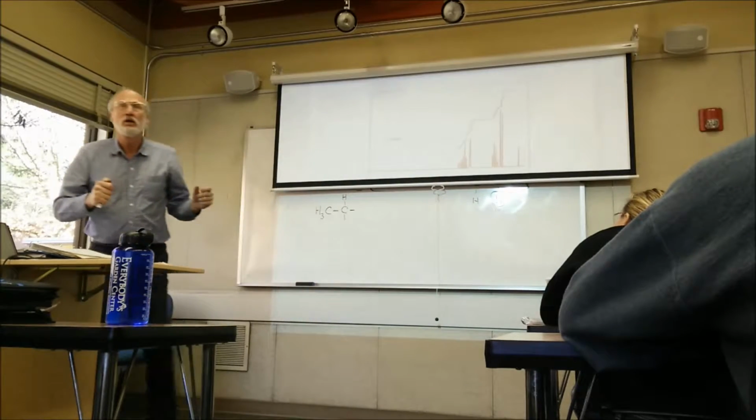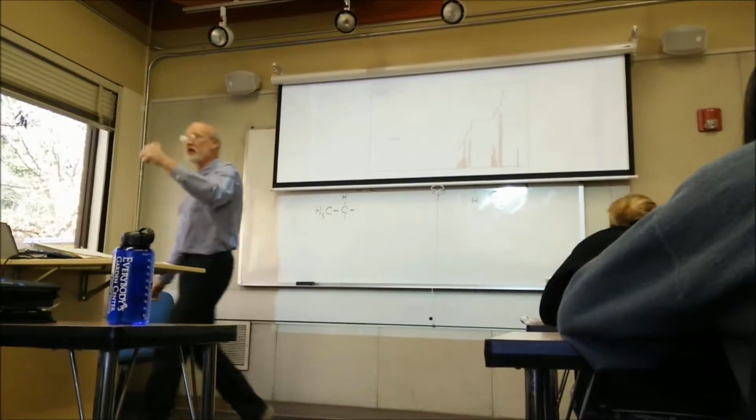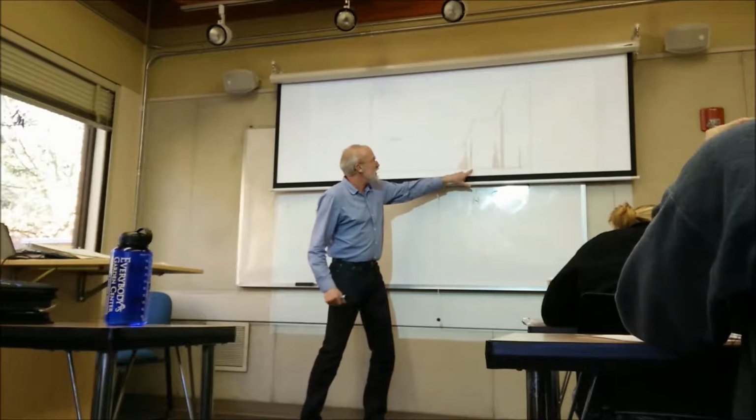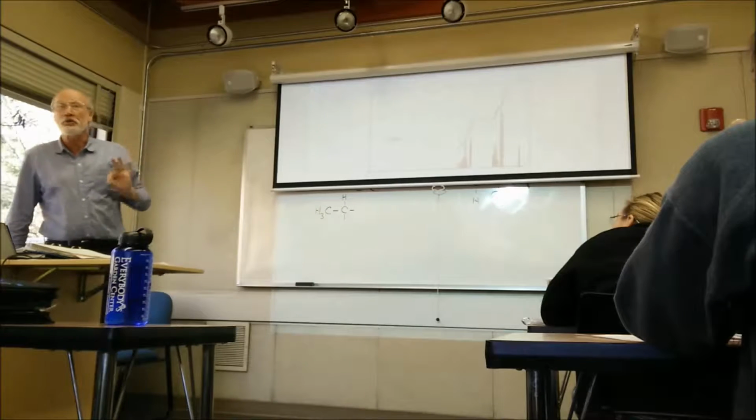What he's saying is that it doesn't dip below the line. Oh yeah, yes. This is called the ringing. That dip below the line, the ringing. There's no ringing. Yeah, and that's also because this is not a sharp peak. It's a broad peak. It's got 2 hydrogens under it.